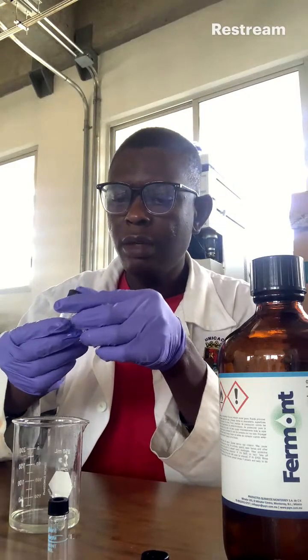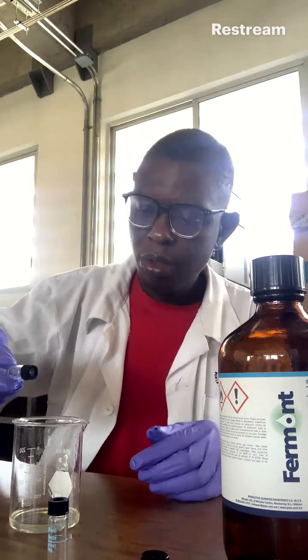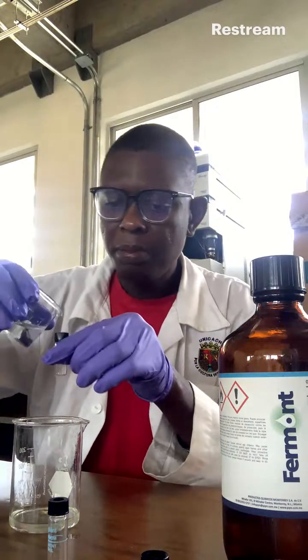The solvent level minimum. So I'll wash it and I'll fill it up.